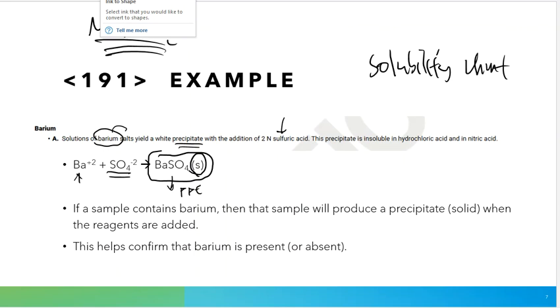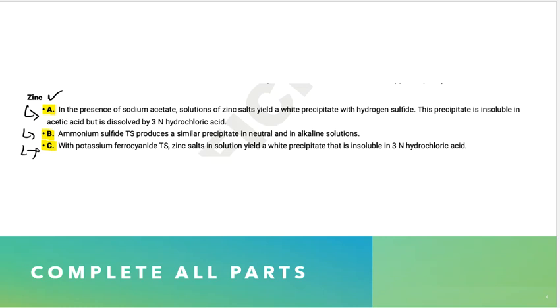The same thing happened with maybe the zinc example that you saw a while ago. If I tested for the presence of zinc because I had a zinc-containing compound, and I do not get a positive reaction here, I don't do anything else with that material because zinc is not present. We tested for it, it wasn't there, and if that's not there, then it automatically isn't what we think that it is. And the same thing for the hydrochloric acid monograph that I pulled up a while ago.